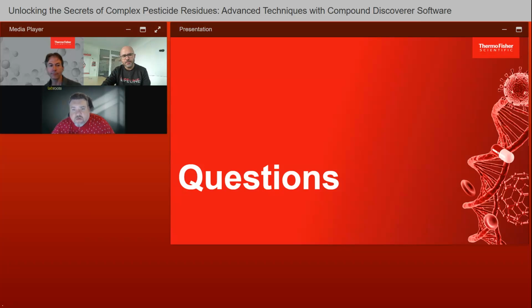All right, thank you. Ralf, can Compound Discoverer 3.4 and the previous version 3.3 be installed on the same PC? Yes, absolutely. You can install CD 3.4 in parallel with the previous version or any previous version. You cannot run them at the same time, but you can certainly install them on the same PC.